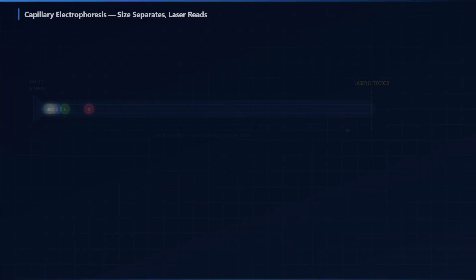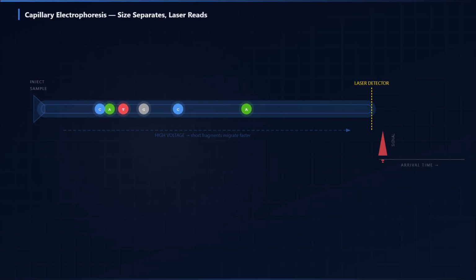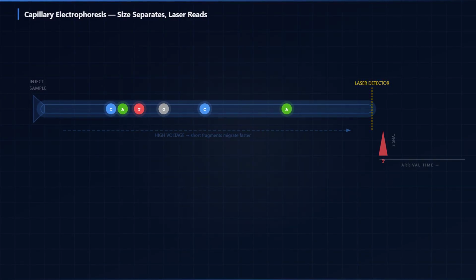The polymer in a capillary sequencer is a linear polyacrylamide-based matrix injected fresh before each run. Unlike the slab polyacrylamide gels used in original Sanger protocols, the capillary format regenerates the separation matrix between every injection. This eliminates the between-run gel variability that limited throughput and reproducibility in early sequencing. Consistent polymer, consistent resolution, consistent read length. That consistency is a large part of why capillary Sanger was the format that completed the Human Genome Project.